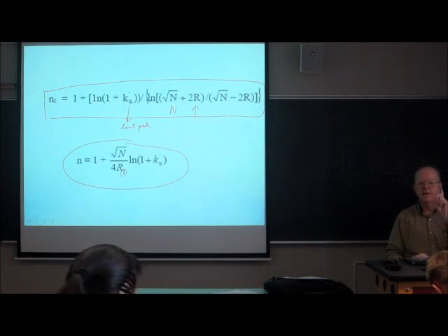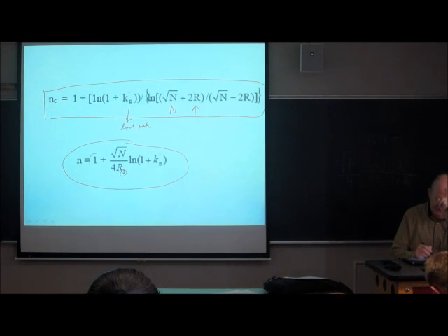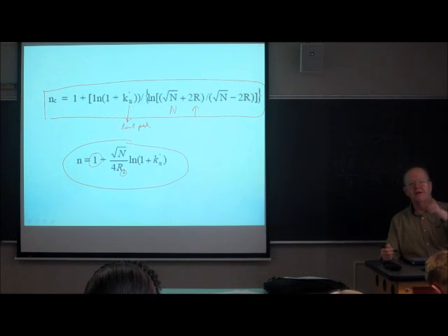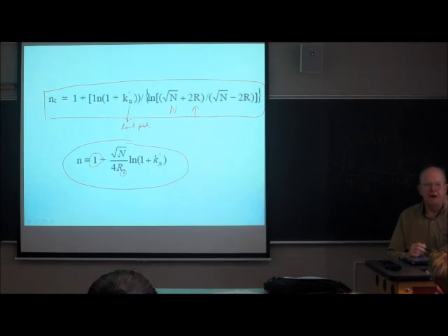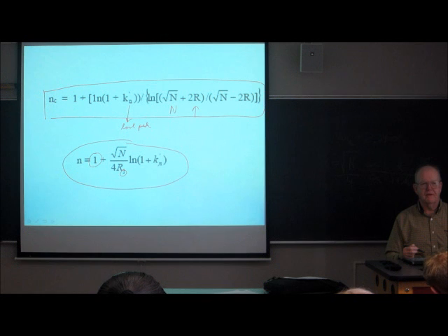Now this assumes that the first peak is located at the dead time of the column. So it comes out, and that's peak 1. And that's what generates that 1 there. So even if you have no retention, that is, you say your last peak comes out with no retention, you put in 0, log of 1 is 0, so you still have 1 unit of peak capacity. But generally, the second term is a good deal bigger than the 1. So that's our isocratic isothermal peak capacity.